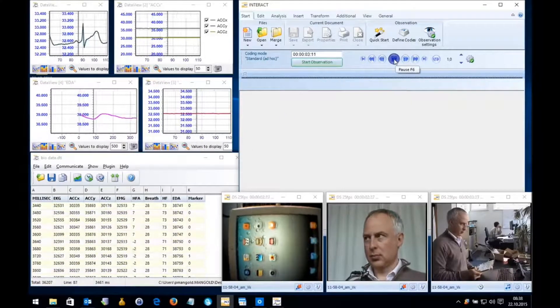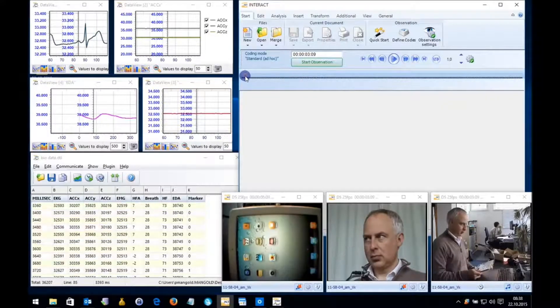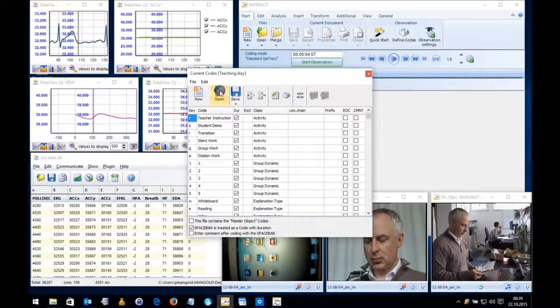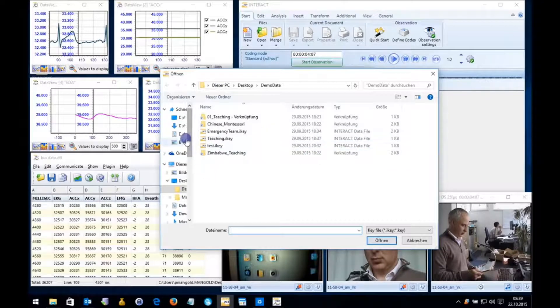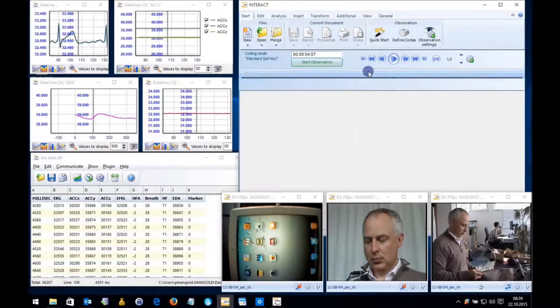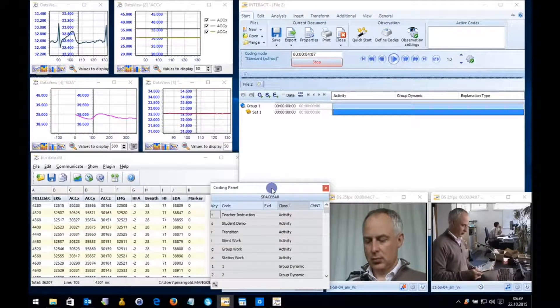In this way you can synchronize your physiological measures with Interact. For example, you can see the skin conductance value is going up here, meaning the participant is getting kind of stressed or aroused. Now I want to start my observations. First I open my coding scheme — let me use this one here. So I start my observation and link the current multimedia files to the document. Yes. And I get this coding panel.